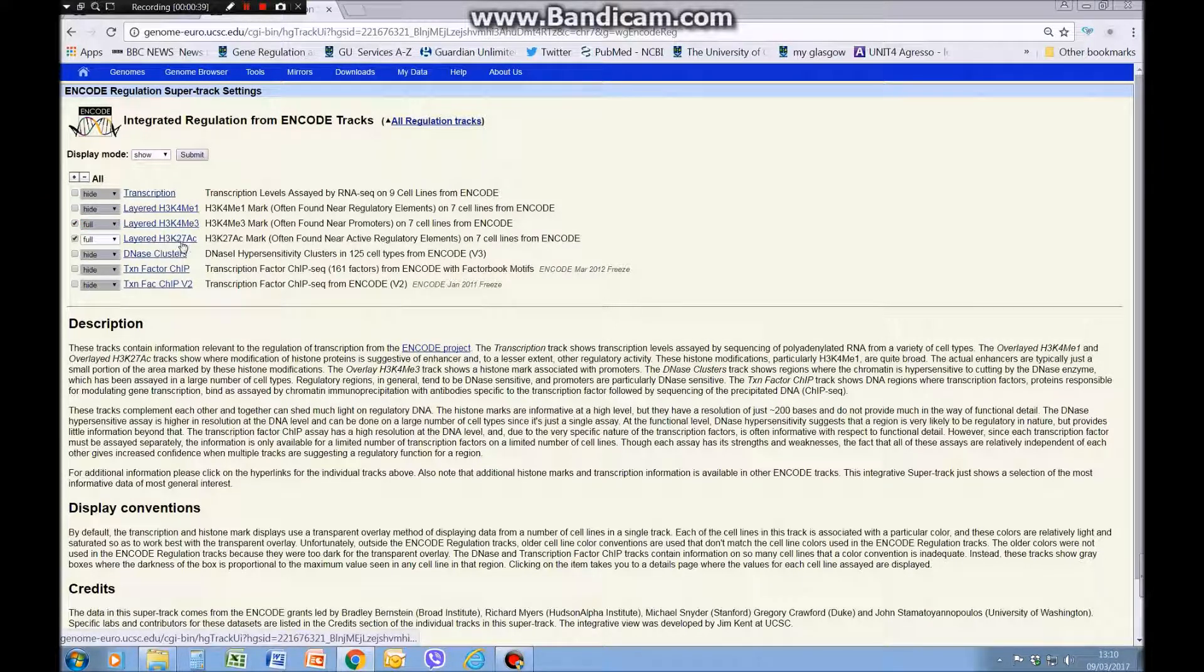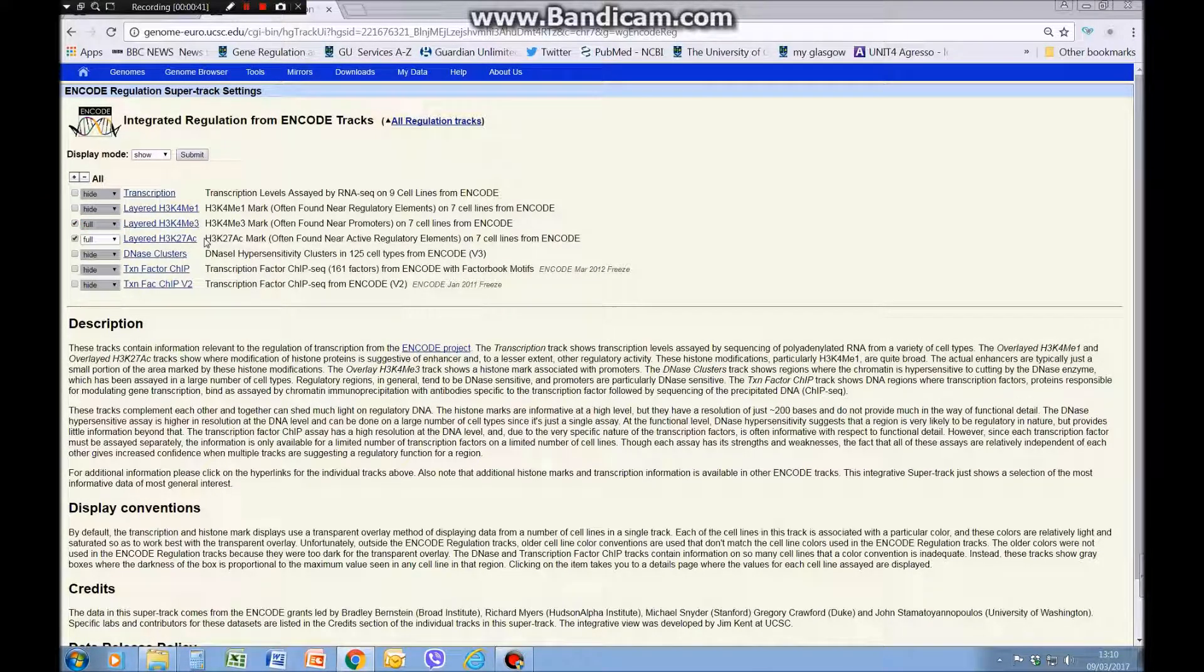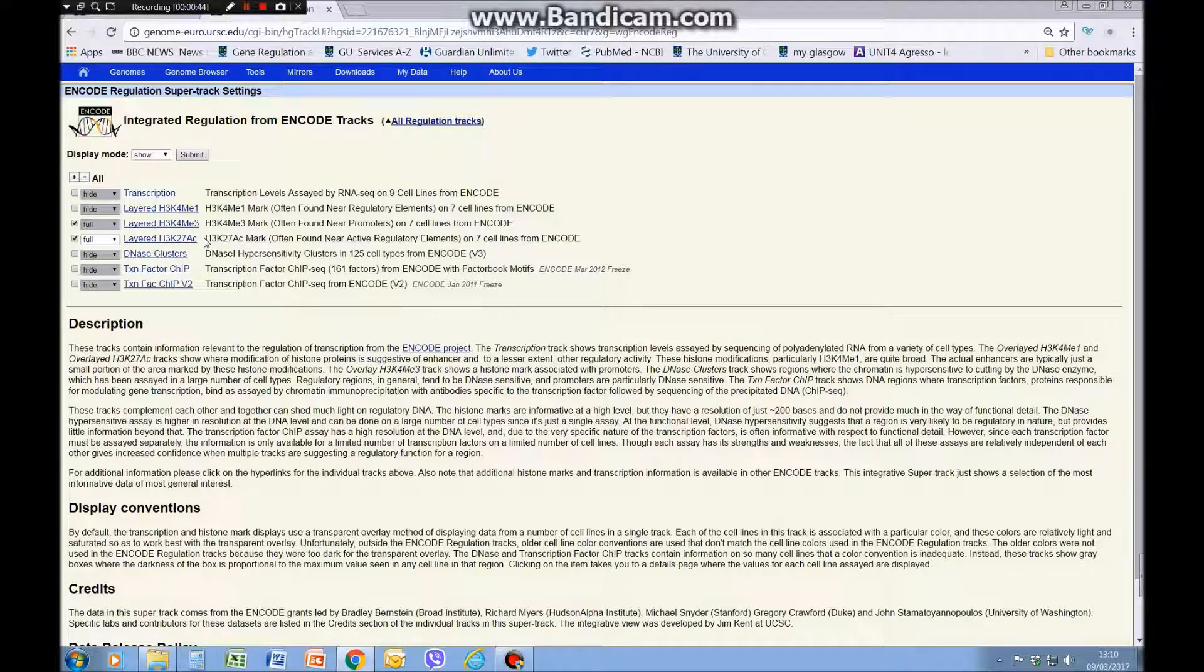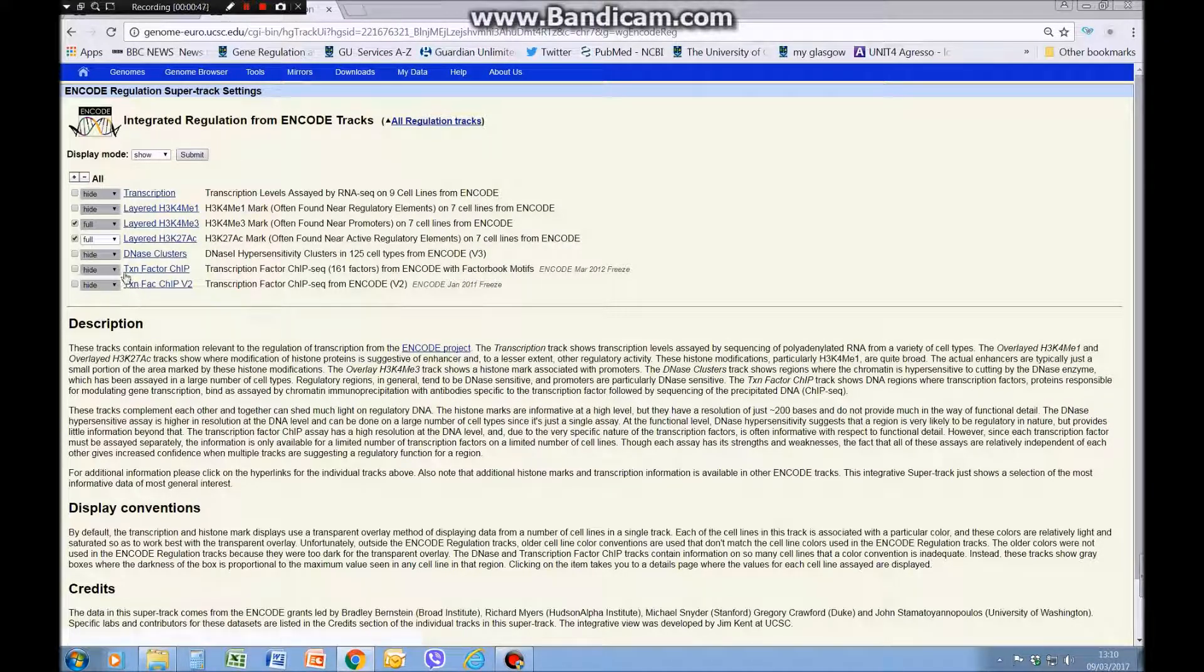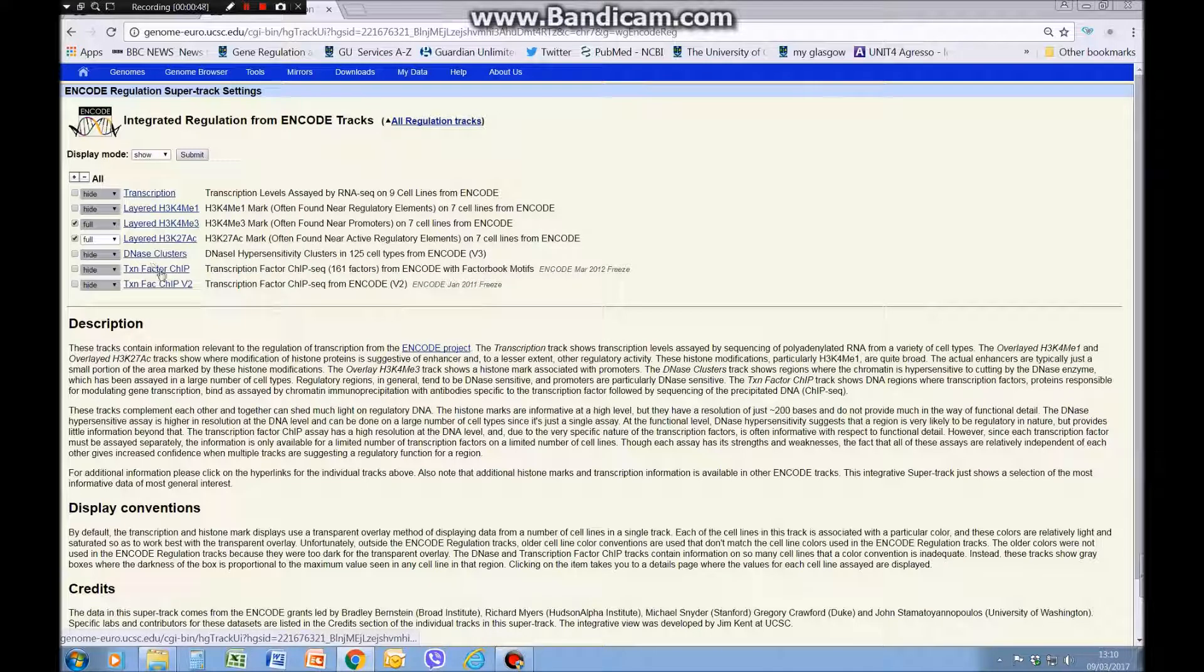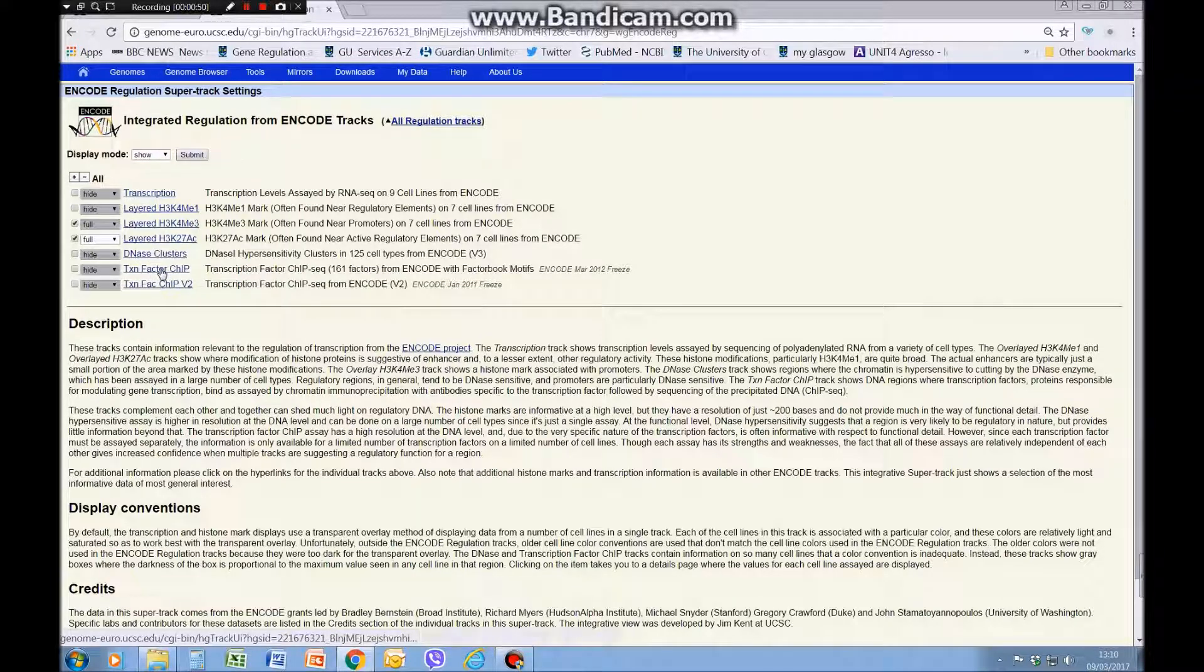We're also looking at H3 lysine 27 acetyl, which is an enhancer mark. For some of your other tasks I've asked you to look at the transcription factor ChIP. We're not going to look at that right now.